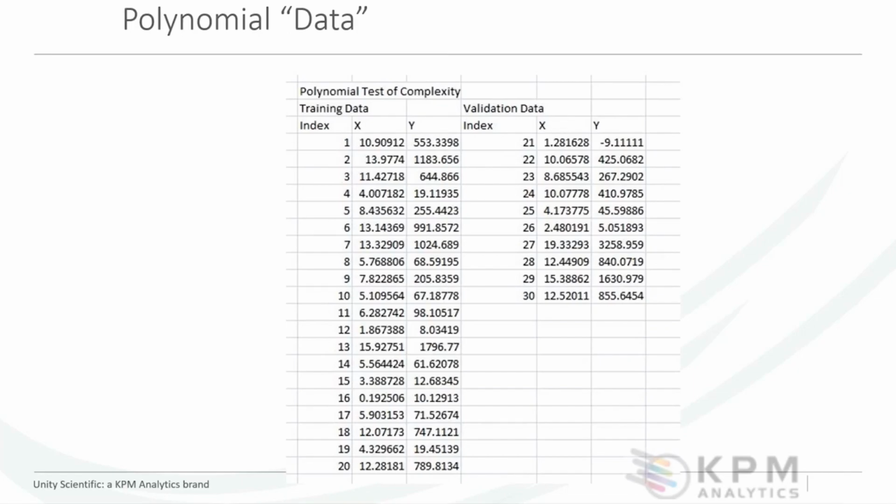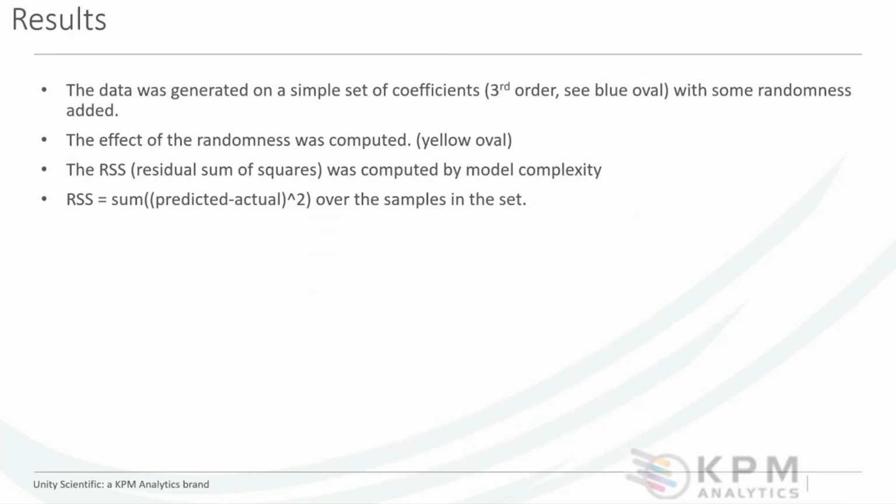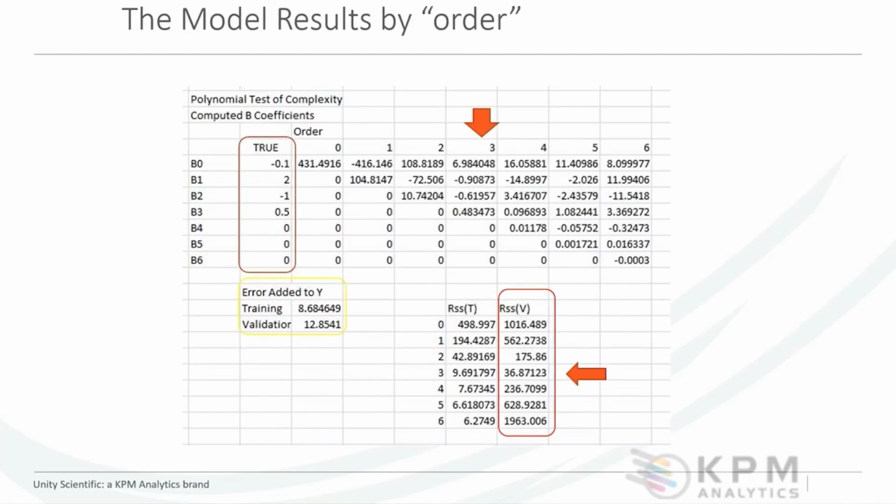If we take a data set that looks like this, we can actually do this in Excel. We can calculate various polynomial explanations or polynomial models for this data set, and we can make a predictive model based on a polynomial equation. We can also use a similar system to evaluate the performance of the model based on errors. We can do this in Excel also, and we can create the equation out to order 6, for example.